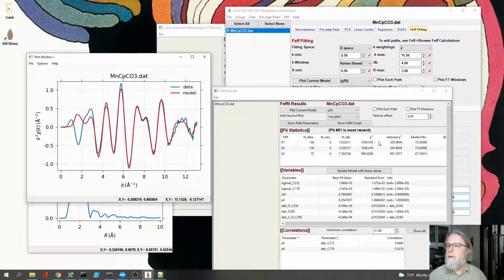Let's see, the fit is still not great. Its reduced chi-square is 200 compared to, it's better than 600, but it could be better than that, I think. It would be nice if it was better. It's still not perfect. There's a lot we've glossed over or forgot about, right? We let all those distances be constrained.